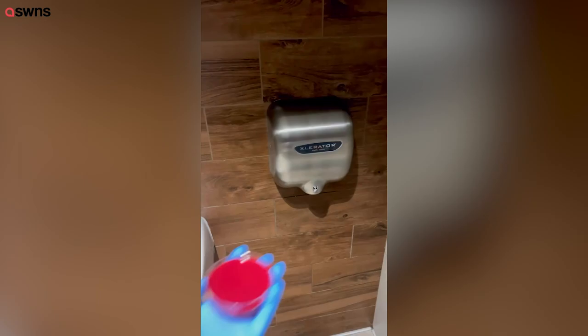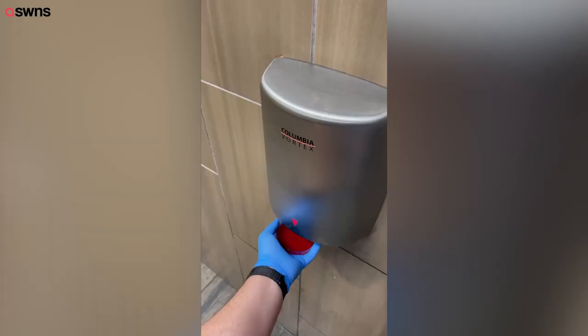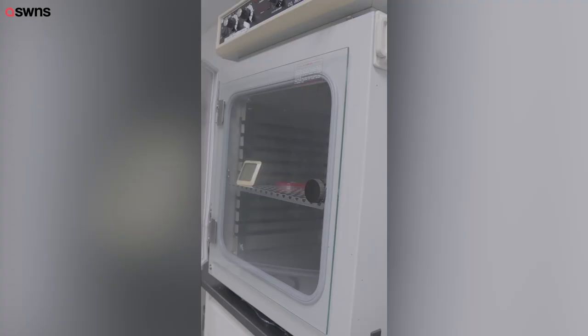And that should do it. Then I went to a couple more locations to solidify my findings and put them all in an incubator to grow. Let's see what we found out.